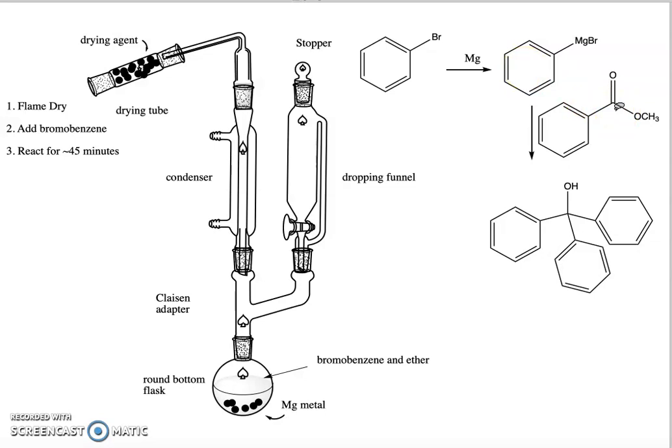We're going to treat this similarly to the way we did before. We have to get our solution of methyl benzoate into our dropping funnel as quickly and as dryly as possible. In our sealed graduated cylinder, we're going to have our methyl benzoate in the dry ether.